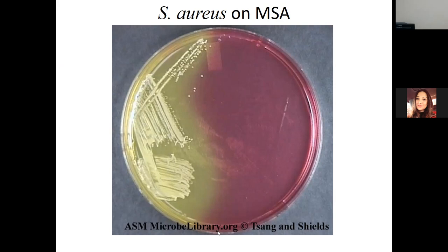So does it do the positive and negative? Yeah. So this would be positive for staph aureus. Okay. Yes. If you pull your plate out of the incubator after one night and it has this color change, that's staph aureus. So the staph epi doesn't turn color. If it stays pink the next day, you don't have any bright yellow to welcome you to the day. There's other things we'll see. We're going to see the other plates, but this is a key plate to use. What about sapro? Does it change?